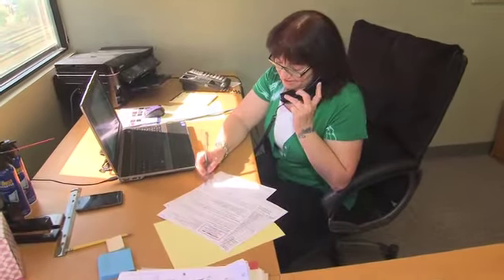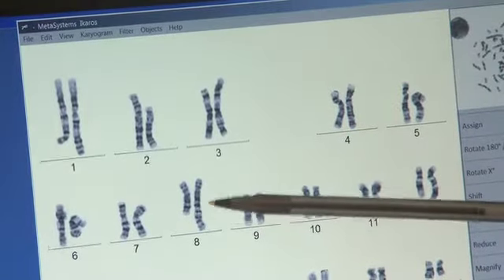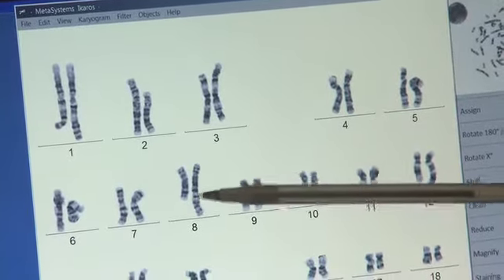Dr. Christine Stevenson, Director of Cytogenetics at Hematologics, has more than 26 years of experience in cancer cytogenetics. Culture conditions are extremely important for analyzing the cells. We need to know the specific cell of choice to be able to determine the type of culture system that we use. We are then able to get those cells to grow and divide. It's very important that we obtain this communication from the flow cytometry. This information that we receive allows us to set up the appropriate culture systems.